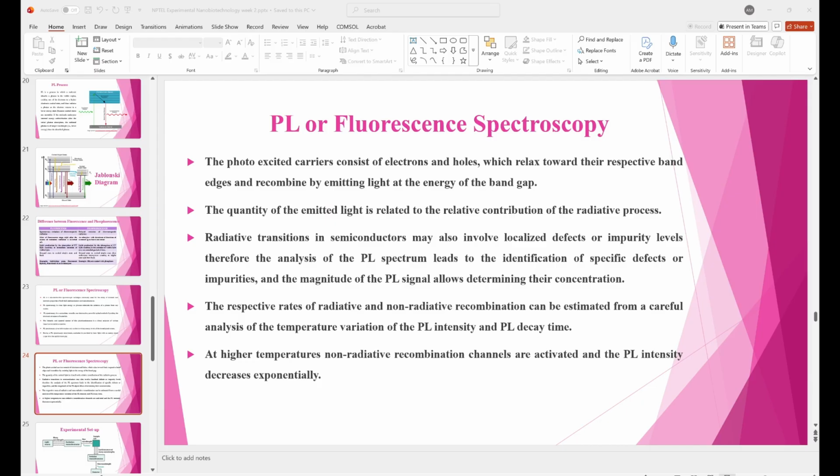Also, I forgot to mention, for fluorescence spectroscopy, you have a 4-walled cuvette because fluorescence is in all directions. So you use a clear 4-walled quartz cuvette for fluorescence. You use a 2-walled quartz cuvette for UV visible. For dynamic light scattering, you can use disposable cuvettes as well as permanent cuvettes. Mostly we use disposable cuvettes. They are made of a compound called polystyrene latex. Since they are use and throw, but we use them multiple times.